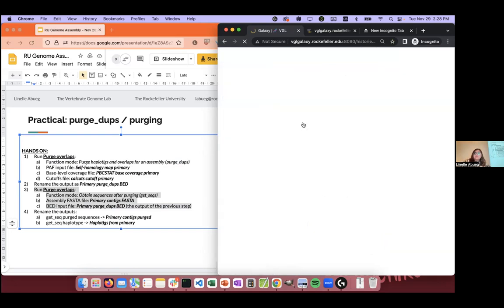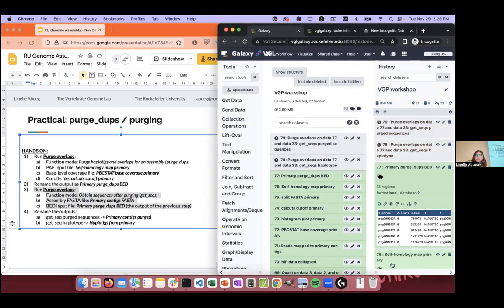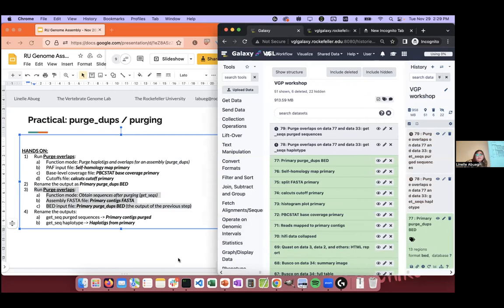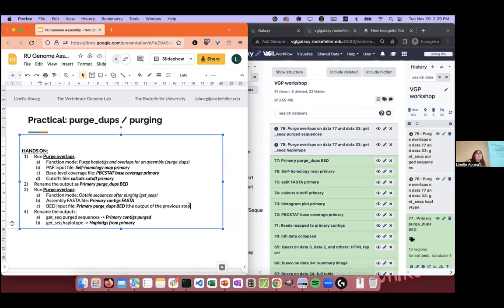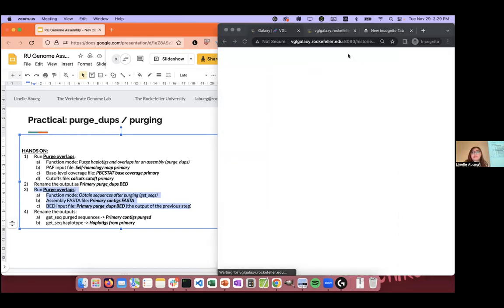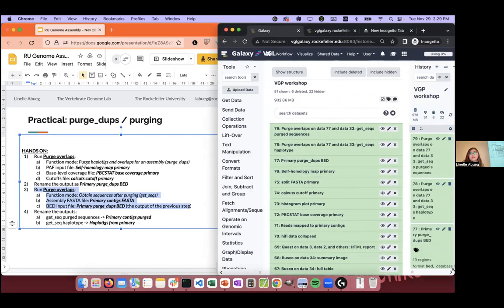Histories. Oops. Does anyone want me to go back to a different slide, or it's okay for now? This is what we're up to. Okay, so we have a chat. Okay, I'm paused. Second to catch up.